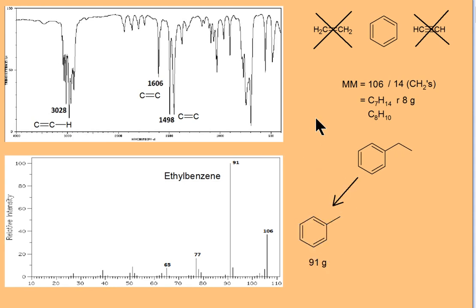If we look at some of the fragments, the first major peak after the molecular ion peak is at 91. That would be with the CH3 group on the end dropping off to give this reduced mass. And then also at the 77, it looks like that methyl group or methylene group has then dropped off, dropping the mass by another 14. And finally the peak at 65, that first carbon that was attached to the alkyl group, giving us that 65 peak as the ring itself breaks down.